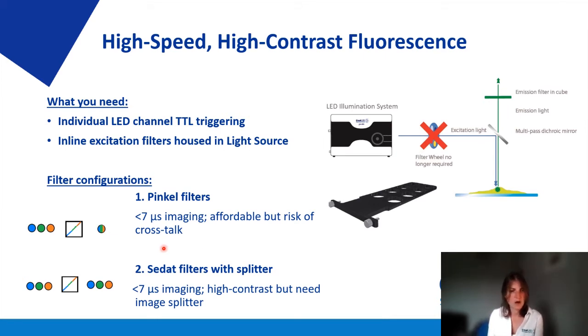And if you want higher contrast, then a Sedat filter set can be used, and the single band emission filters can be housed in an image splitter or a camera splitter. So it's higher contrast, but it also comes with a higher price tag.